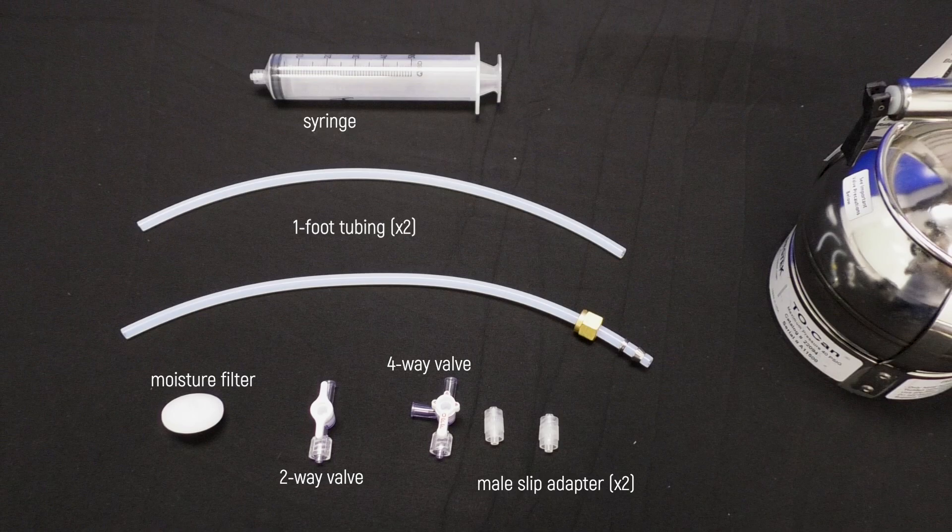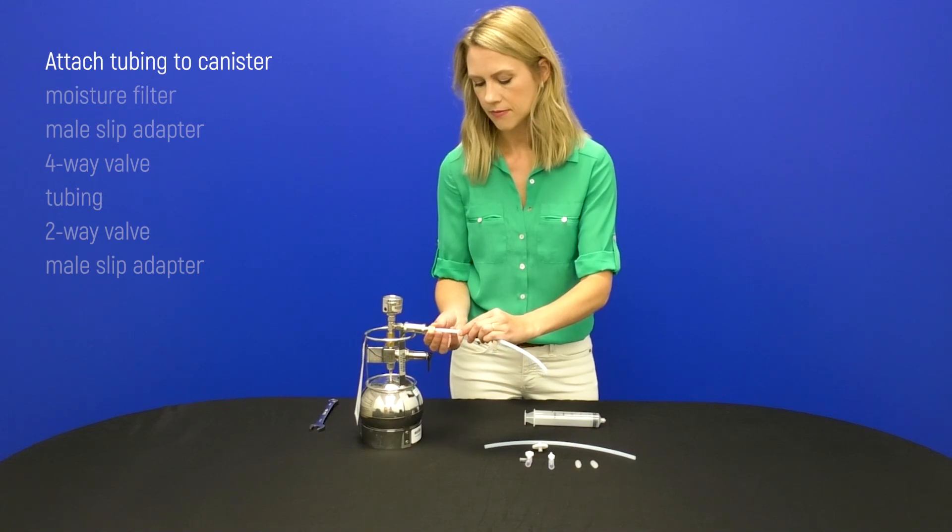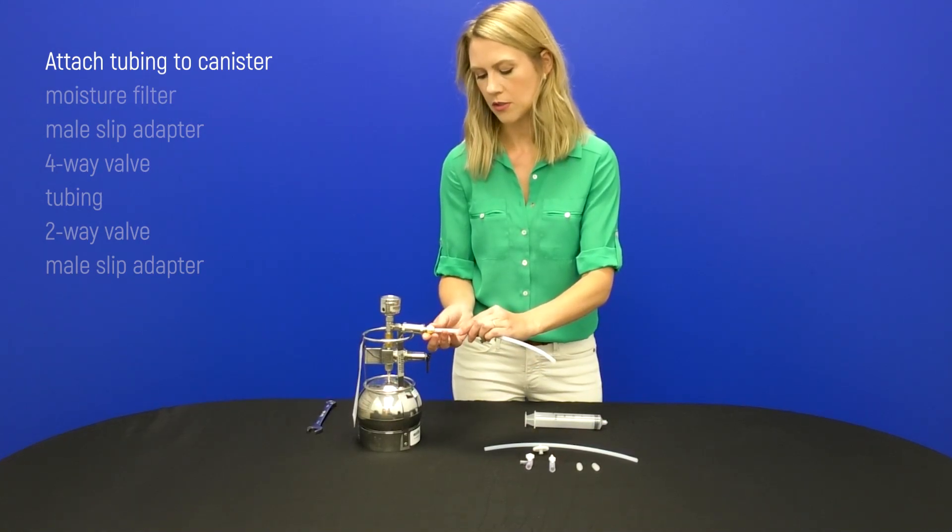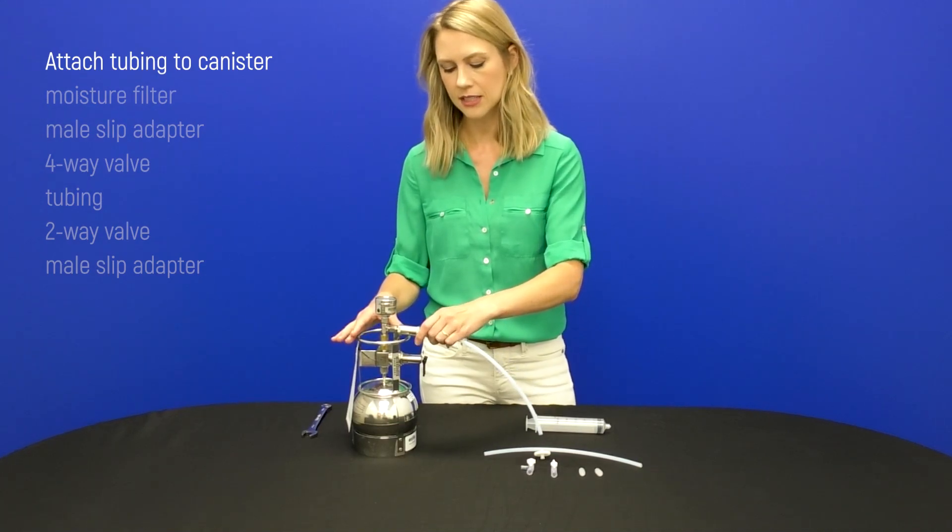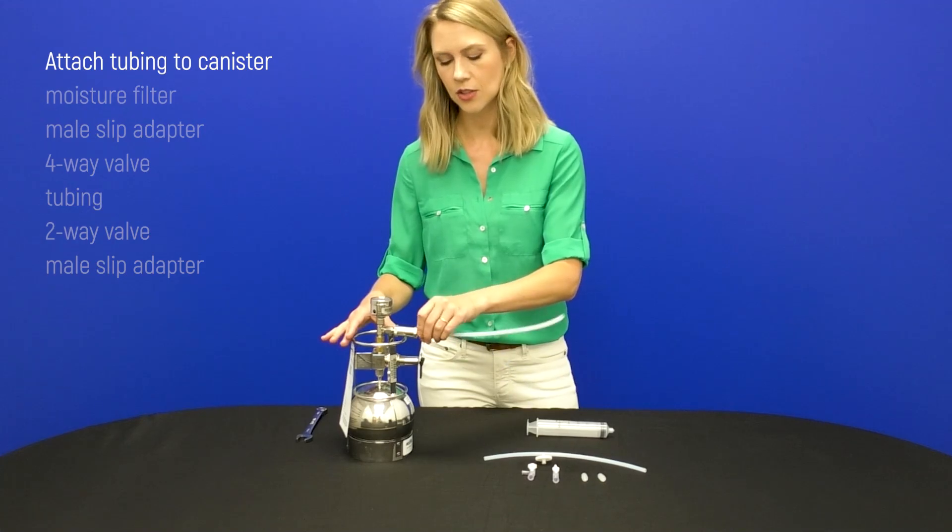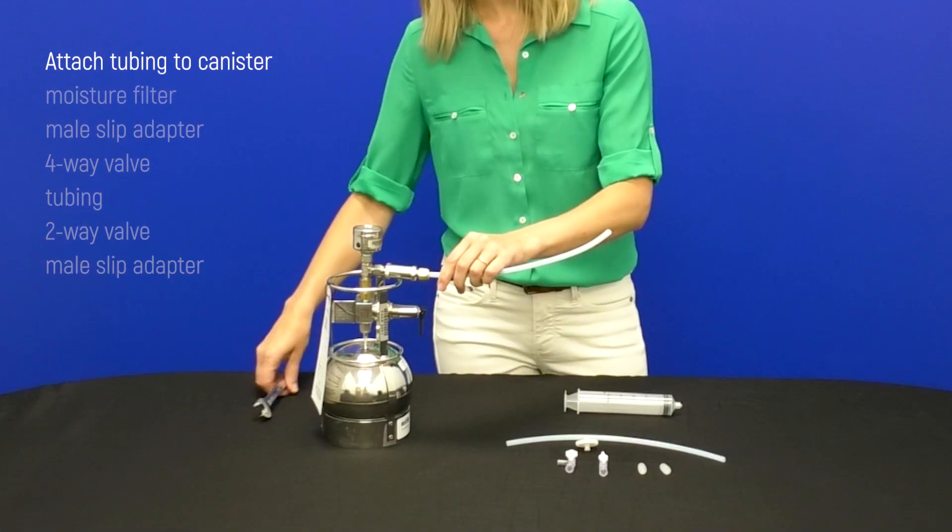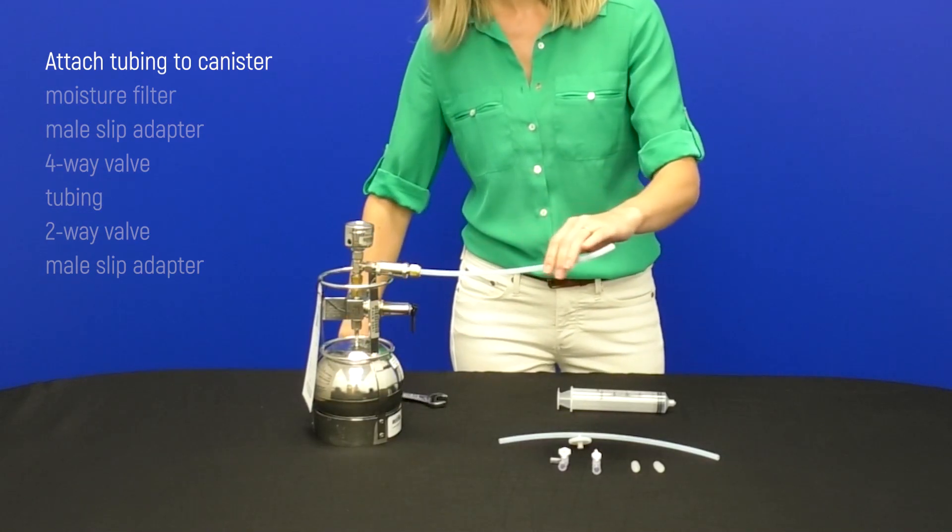You'll start off by attaching the tubing to the canister using the fittings and ferrules. You'll want to get it started with your fingers. If it doesn't seat right like this, you want to loosen it up and reseat it to make sure it threads on easily so you don't accidentally strip the connection. Then tighten up with your 9-16 inch wrench.